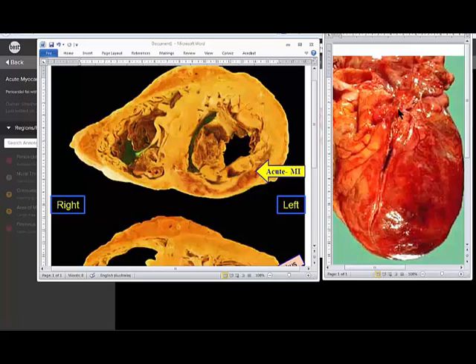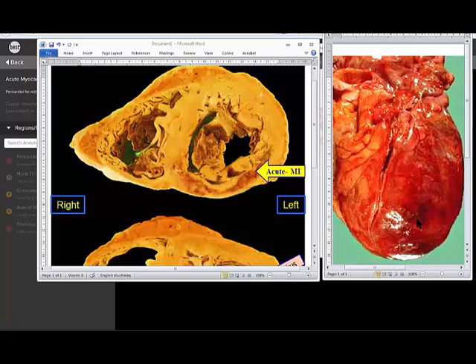What I am trying to show is left anterior descending artery showing a big thrombus affecting the area in the left ventricle which is now infarcted, darker in appearance grossly in the early stage because of edema and hemorrhage. And if I take a cross section of this heart, the myocardial infarction case, you will see the cut section somewhat like this.